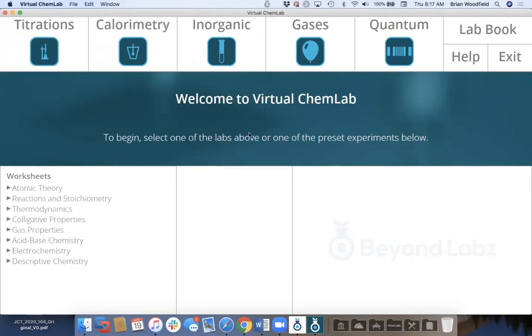And so this is kind of how it works. You got help, lab book, which I'll show you over here. And over here on these worksheets, these lab activities, this is where we have the corresponding table of contents, if you will, of those same activities.